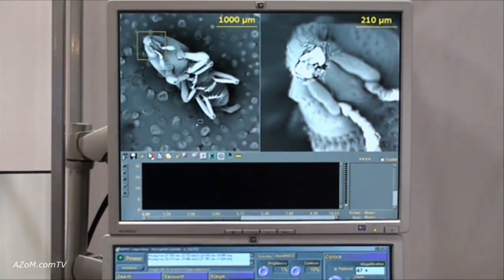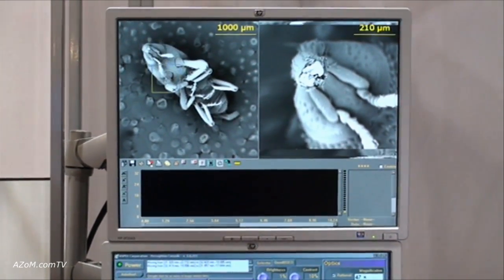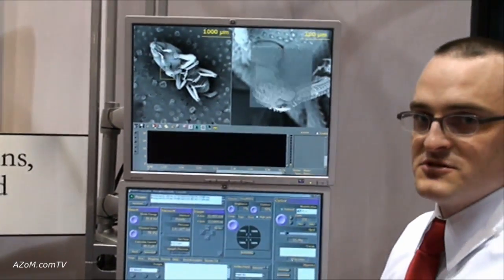We utilize a left and right imaging mode because we are an integrated SEM-EDS vendor. We can zoom in on specimens and easily identify types of materials. If you're looking at particulates or contamination, you can acquire elemental composition spectra as well.